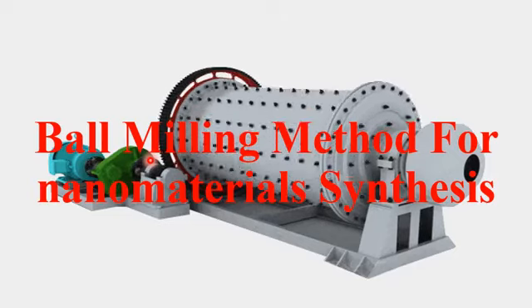So student, in simple words, the ball mill method is a mechanical crushing or mechanical milling method based on a top to down approach, and with this method we basically convert a bulk material into a very small nanometer scale dimension material.